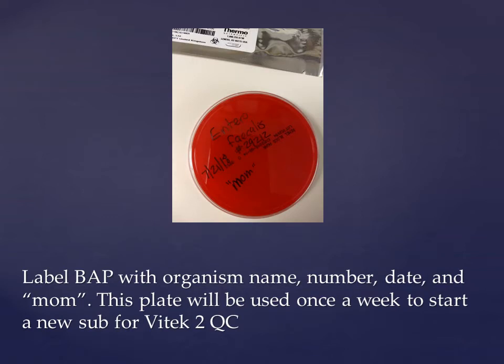So now we're going to start with the culture loops. We're going to make sure everything's up to room temperature. Again, we're going to label with the name of the organism, the number, today's date, but we're also going to call this the mom plate. This mom plate will be used once a week to sub for the new week's growth for the QC and the Vitek 2.